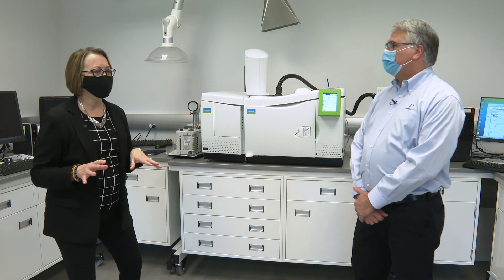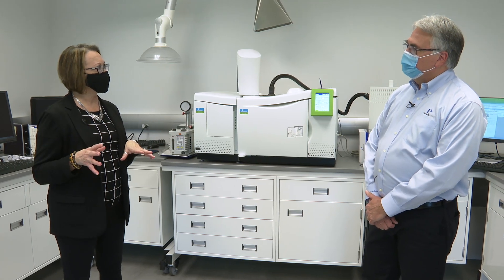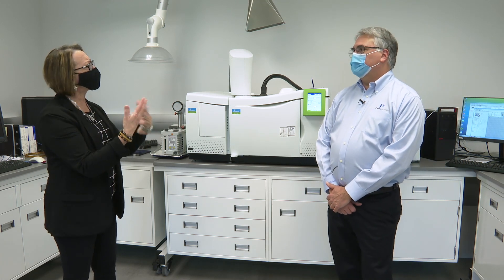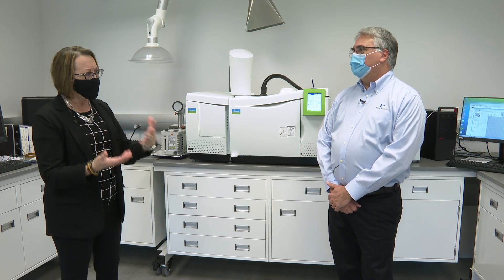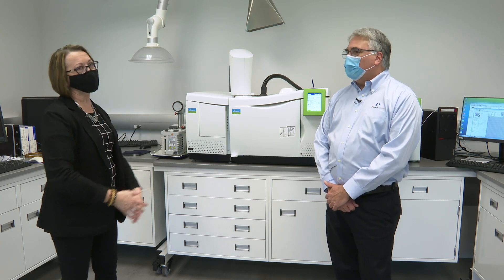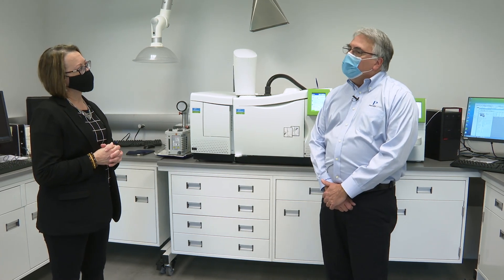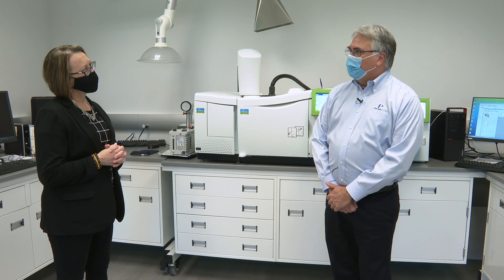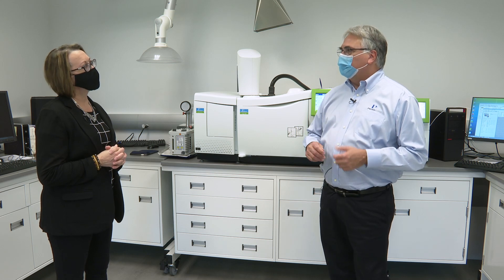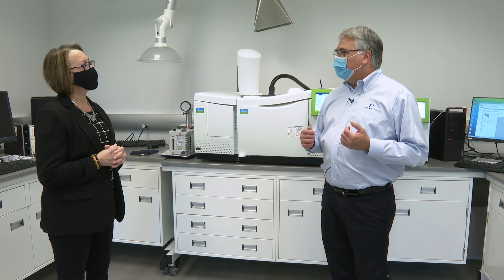During the pandemic, there was a lot of focus on hand sanitizer, and you can use various instruments to test hand sanitizer. One of the principal ingredients of hand sanitizer is ethanol, ethyl alcohol. Virtually all ethyl alcohol in the United States is produced from fermentation, and as such it has to be further purified. Sometimes during the purification process of this ethyl alcohol, other components get in there.